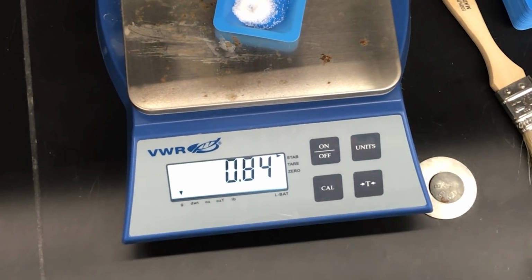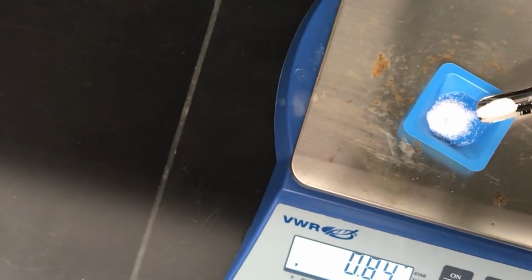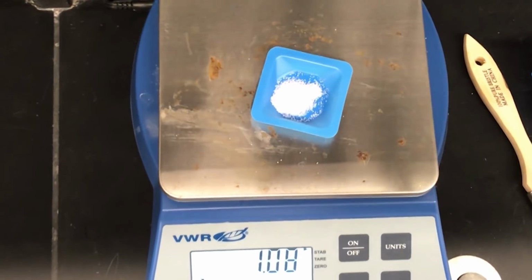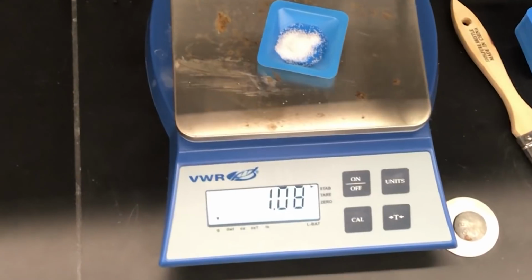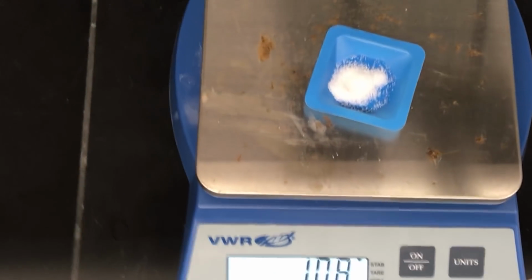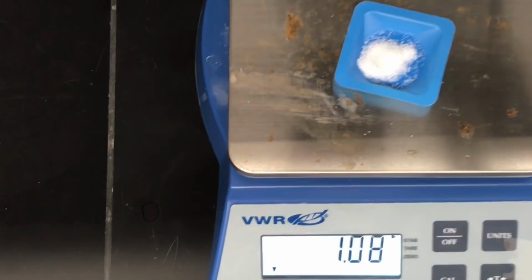I'm going to try to get as close to 1.00 grams, but I know that I'm not going to, and that's just fine. Okay, I got 1.08. I'm fine with that. And I can see 1.08. Do I know that number beyond that 8? I don't. It could be 1, it could be 2, it could be 0, it could be anything. I don't know.